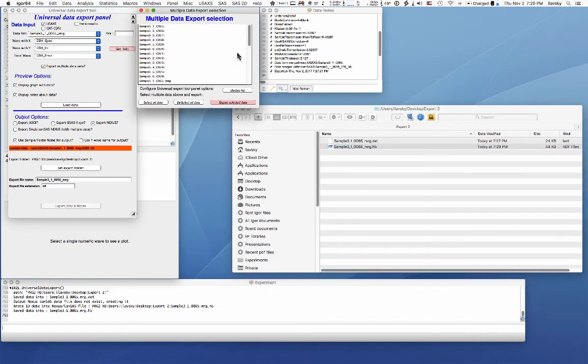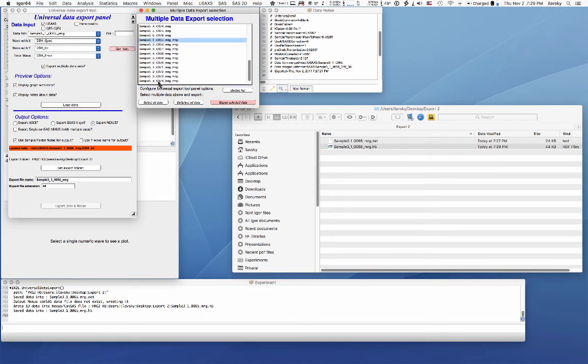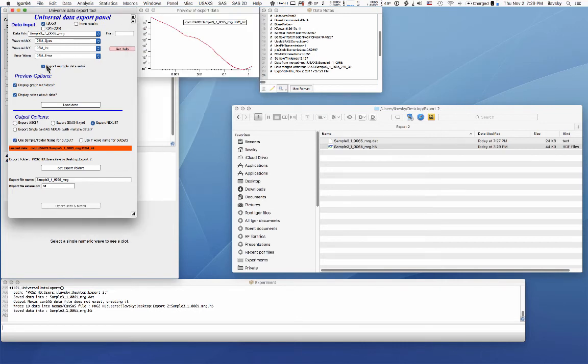And then of course, what you can do is you can go in and there's a way to export multiple data sets. You can go in here and you can export multiple ones. So you select them here and then you hit export. So this is for small angle scattering data.